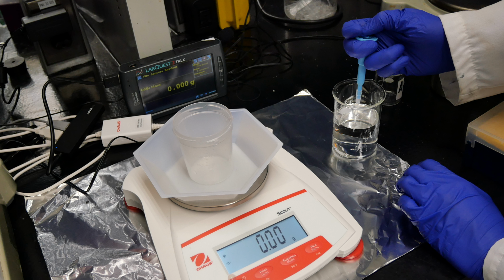Compared to pipettes where you can change the volume, there is only one level to push down the plunger. You don't have to push it down one level and continue to push to get out all of the liquid.